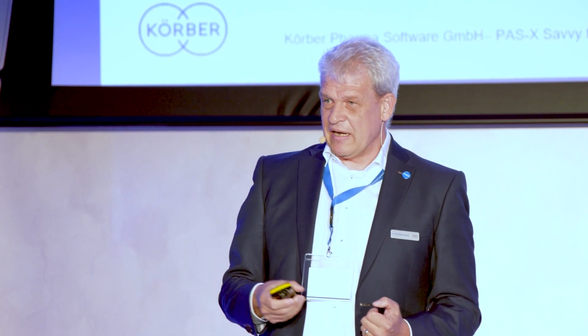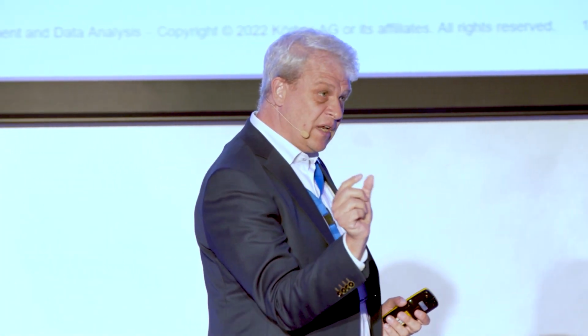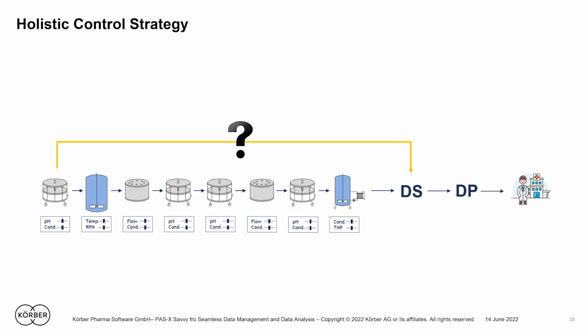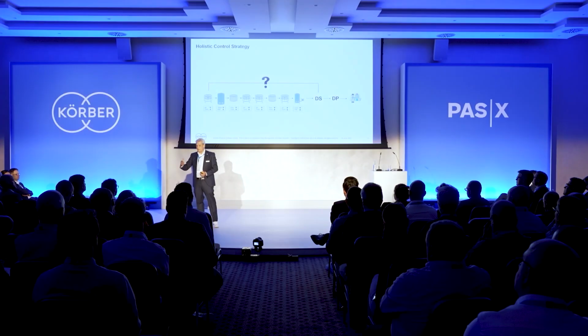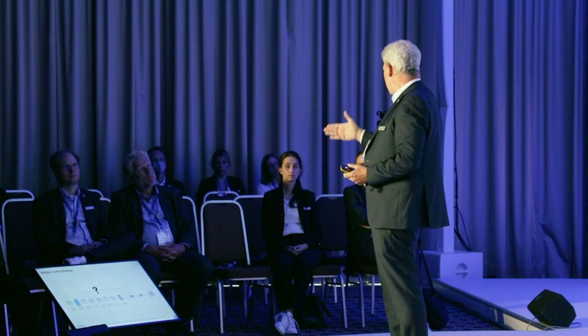We link these elements together, and now we can analyze what would be the real sensitivity of the variation in an early step to a later step on the drug substance, drug product, or even the patient. Now the envelope is changing. Also with CGT, we get much more into even including the patient.